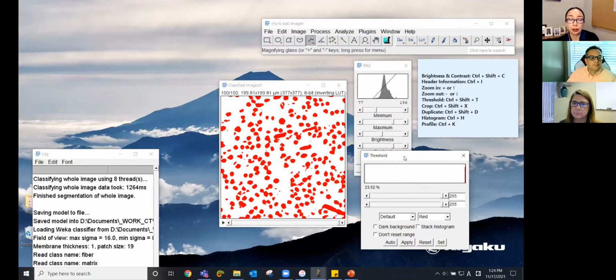If you're going to use ImageJ, TIFF is probably a good format, although ImageJ supports other formats too. I think TIFF is the most widely used format for X-ray CT. It's lossless. You're not going to compress and lose some information. For example, you do not want to use JPEG. If you do that, you will lose information. But that's how you save your reconstruction. I hope that answers the question. Carlos, if you have a follow-up, please go ahead and ask.